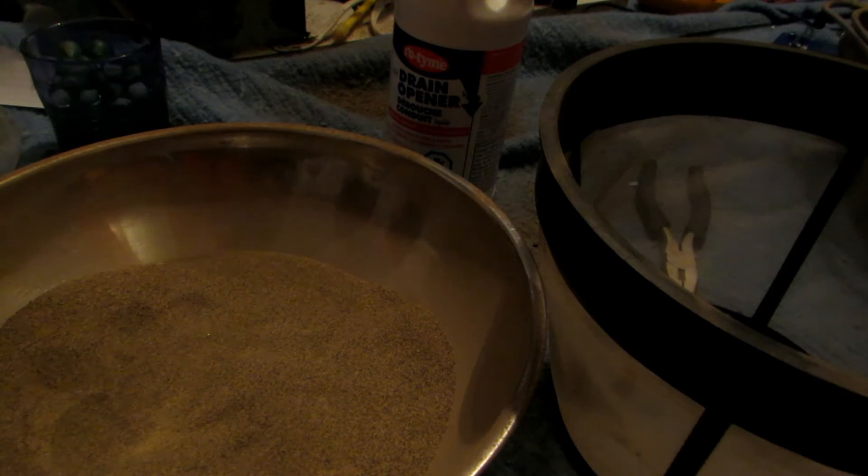At that point the sulfuric acid will start boiling over and we can collect it — it should be nice and pure. Of course, water is going to come over first. That's basically the principle behind this and hopefully it works.